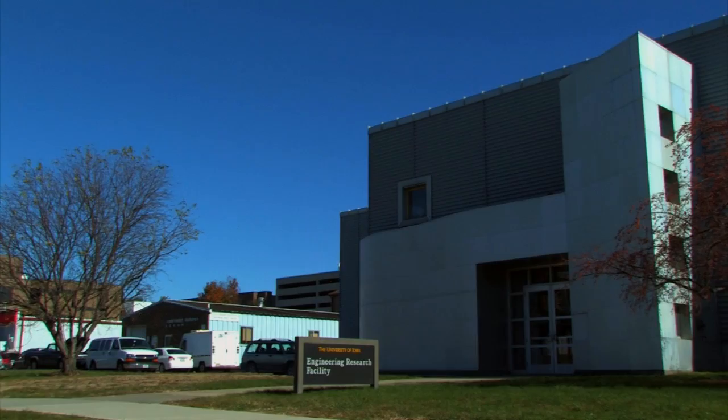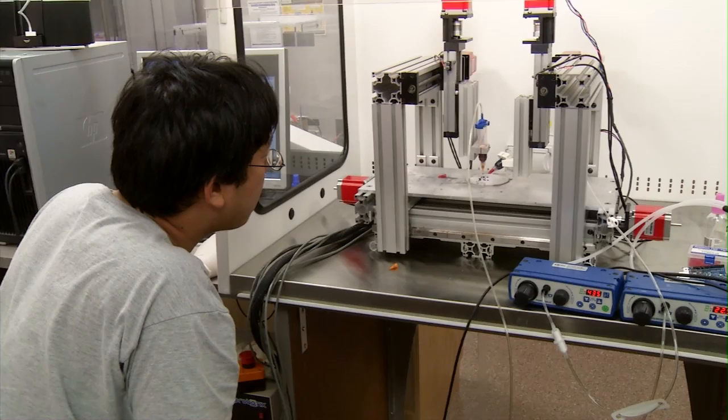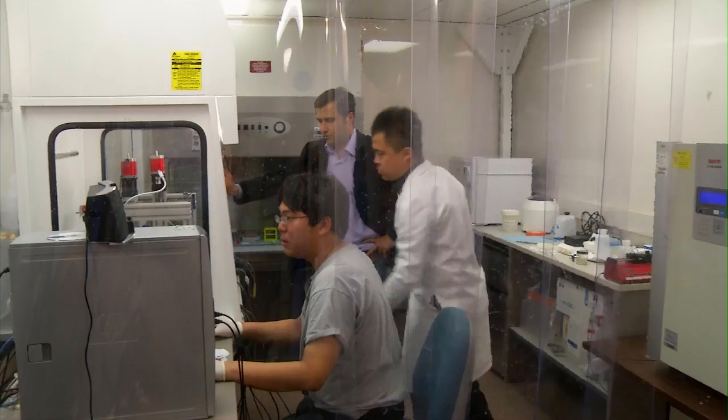On the University of Iowa campus, tucked away in the mechanical and industrial engineering department, machines and robotic arms whir and hum, busy printing. A 3D printer is at work, but it's not printing models, specs, or engineering parts. It's busy printing organs.